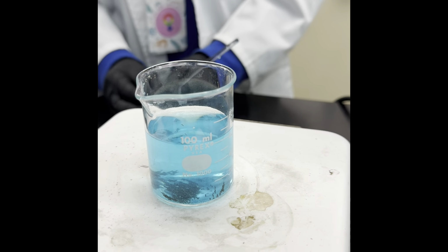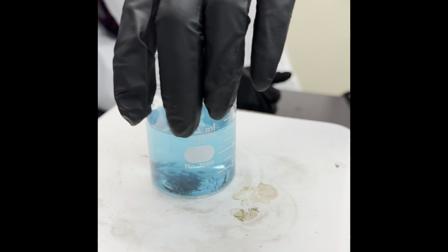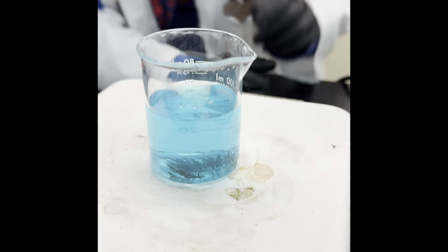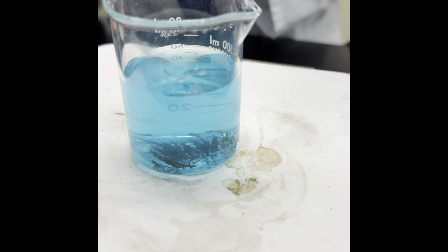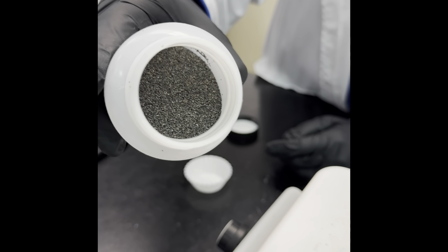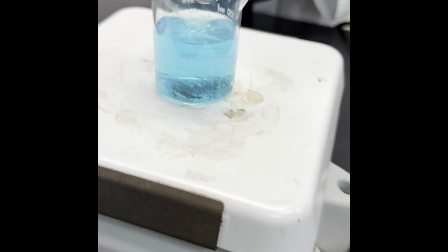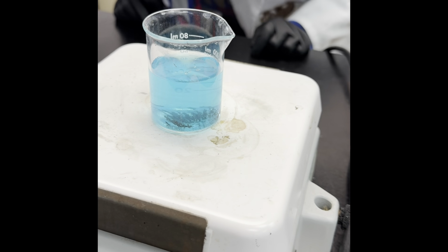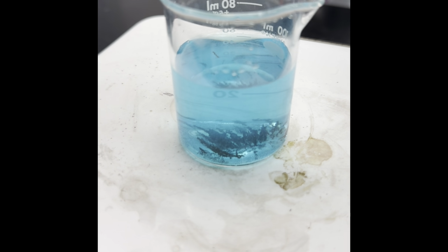I don't know if you can see, but if we flip this around, you might be able to see that that iron, the powder in the bottom, the solid in the bottom, isn't quite that silver color, right? Make some observations about how that's changed. What color does it look like now?